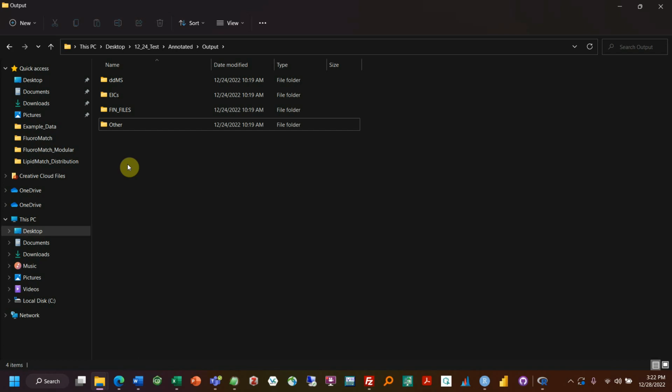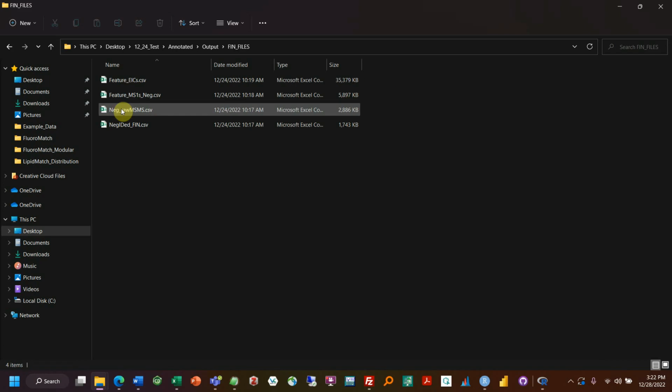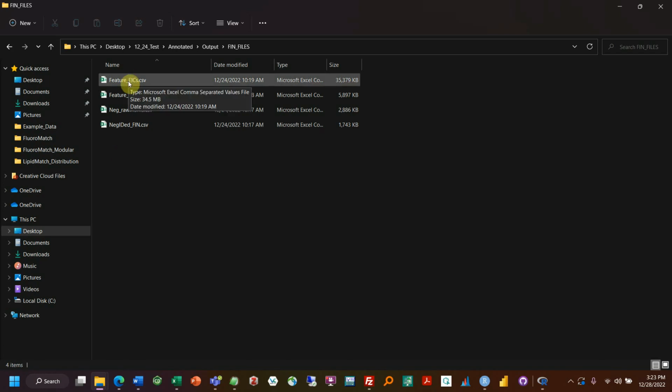Notice it can take a few hours to run, especially if you have a lot of DDMS2 files, even longer if you have maybe not a high-performing computer. For speed, generally, because it's only the R, it mostly accounts for having multiple cores, which it does use, as well as the speed of each of those processors. So these are your final files and should be generated by the end over here.